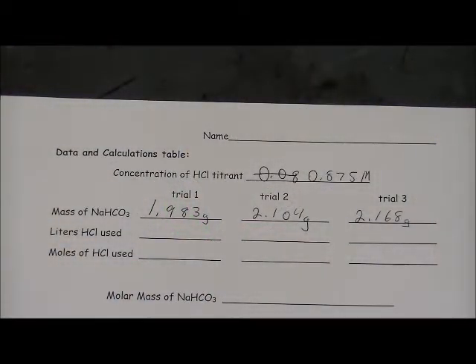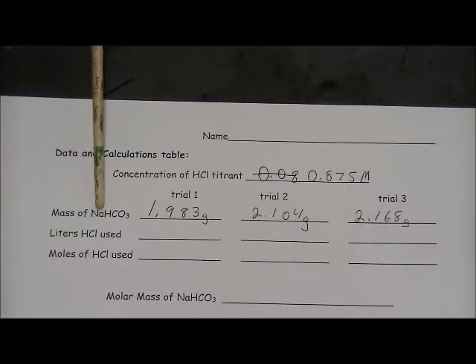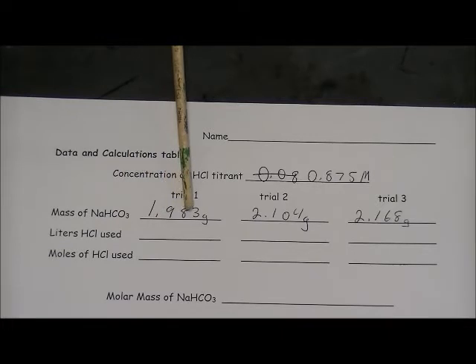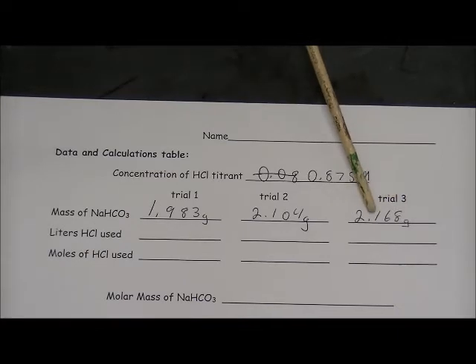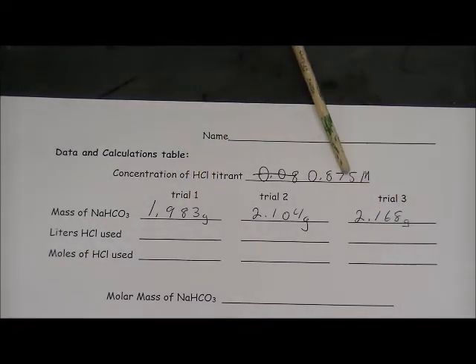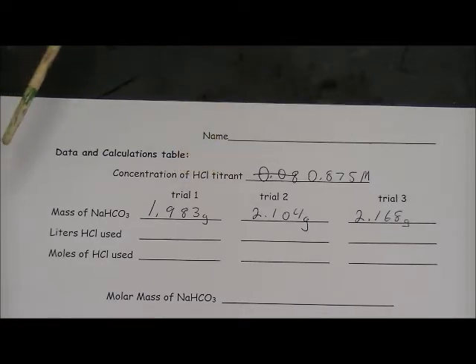Here is that information entered into our worksheet. The mass of sodium bicarbonate for the first sample, 1.983. For the second sample, 2.104. And for the third sample, 2.168. I've also entered the concentration of my titrant up here, 0.875 moles per liter HCl.